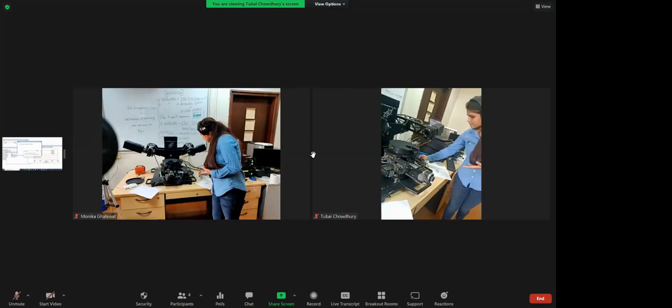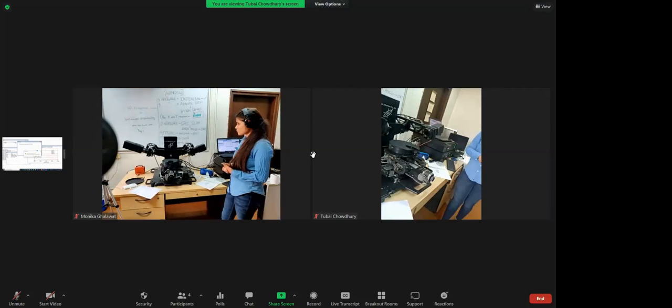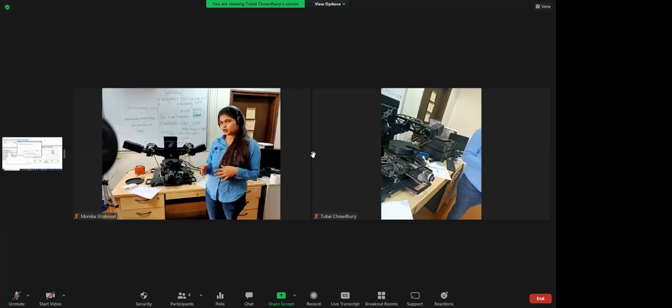Can you show the demonstration, means for any unknown material, how to generate the model fit? For an unknown material, to generate a new model. Yes, okay. Any simple one. Okay, let me tell you.